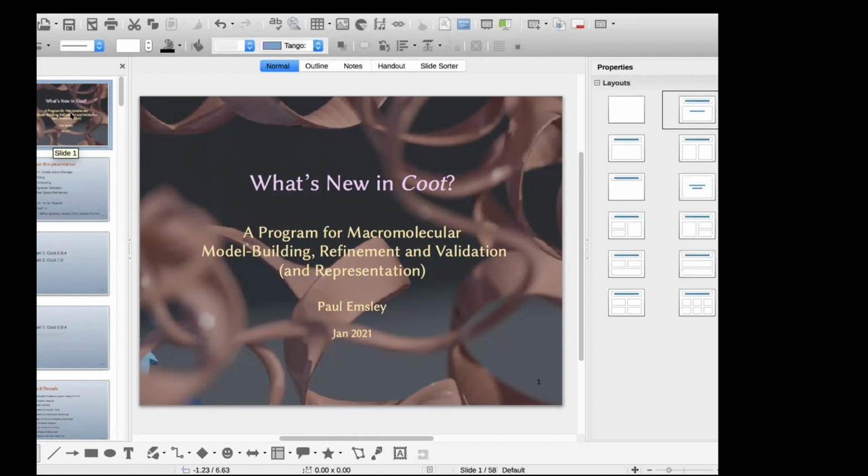Yeah, but they are large objects in Blender, and they're not easy to manipulate, especially viruses, which is what I was trying out. But yeah, you can do it today. You can export it using, well, the current export format is OBJ, and I may add others. That sounds great. That sounds like exactly what they were asking for. So perfect. Any other questions?